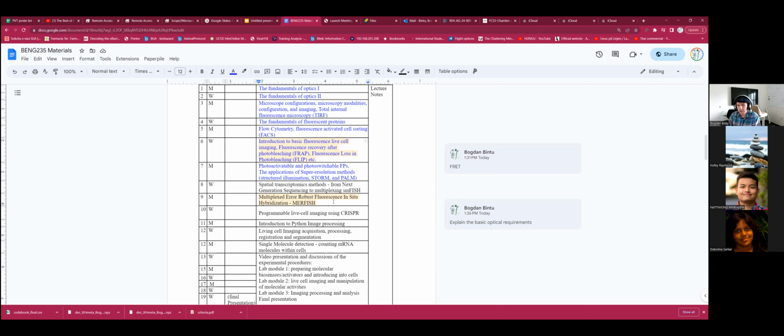So I can explain a little bit. One of the very exciting recent directions of imaging has been the ability to image with a lot more colors than ever before. And that's a very fundamental thing, right? If you have a sample, like a cell, ideally you would image that cell in more than the 5 fluorescent colors available on a normal microscope.